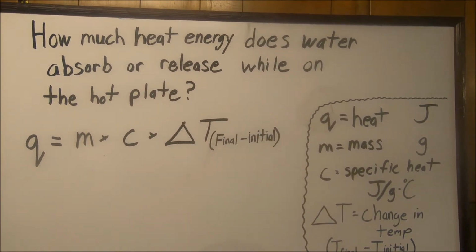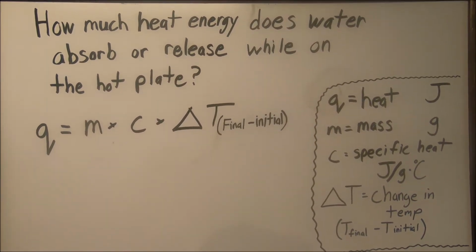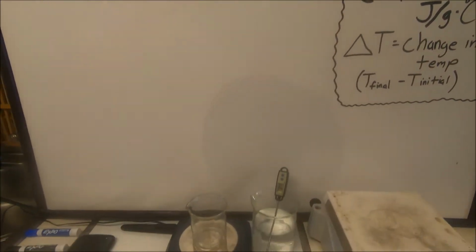Well, greetings, Chem Department. Today we're going to look at how much heat energy water absorbs or releases while on a hot plate. So to begin with, we're going to start out.